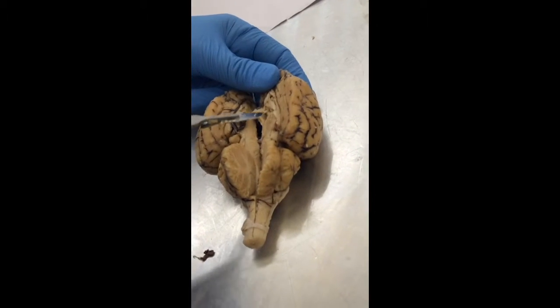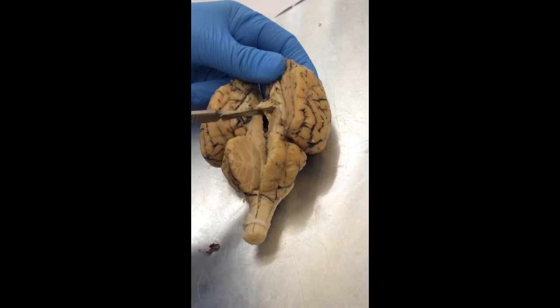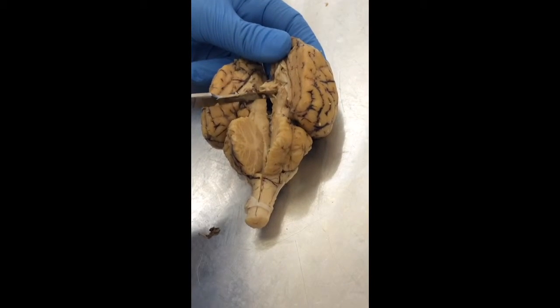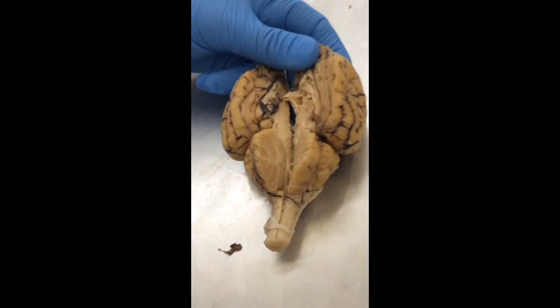Now, this whole rounded structure here is the intermediate mass of the thalamus. Surrounding it is a big ventricle called the third ventricle. This is all third ventricle. The third ventricle connects to the lateral ventricle with a little hole, and that hole is called the interventricular foramen. You can't see it, but it's up there.